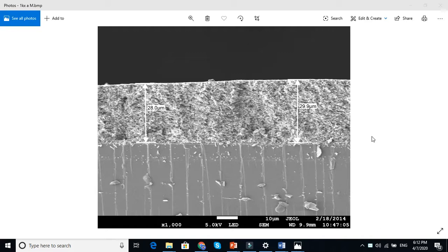Whether the shape looks like hollow, whether the shape looks like a nanofiber, whether it looks like a nanotube, or it looks like blocks, or it looks like cubes. So it always gives information about morphology, and particularly about the surface morphology.